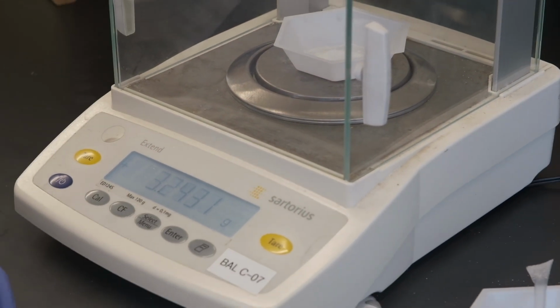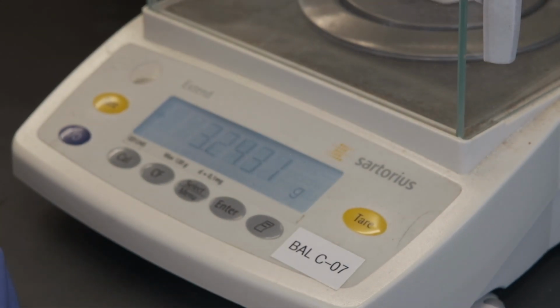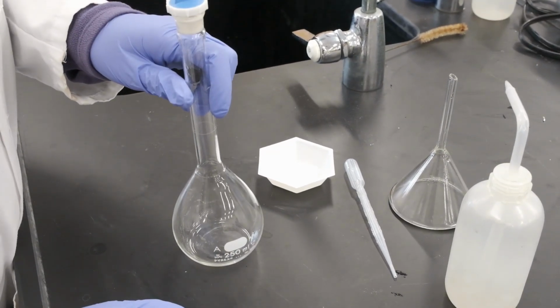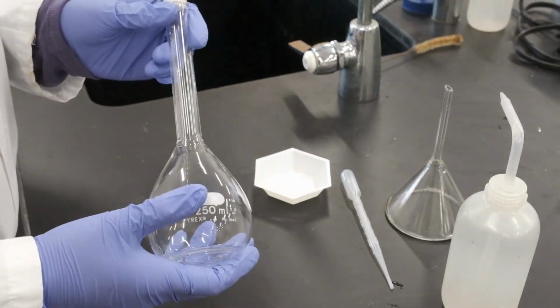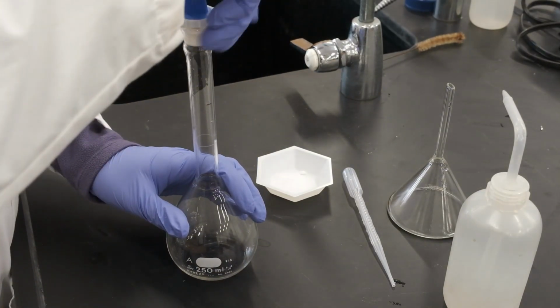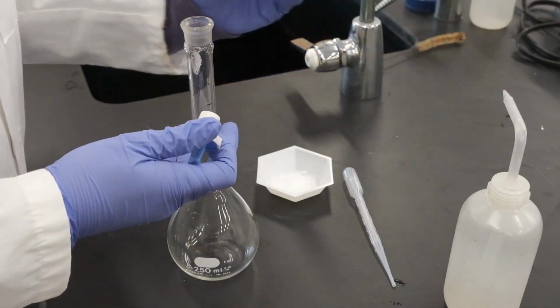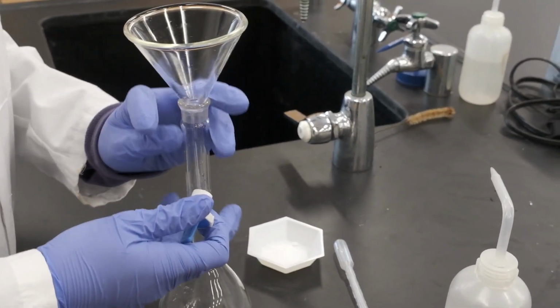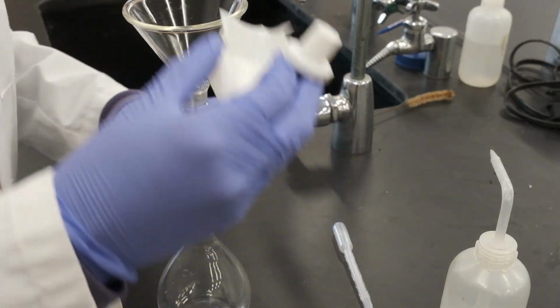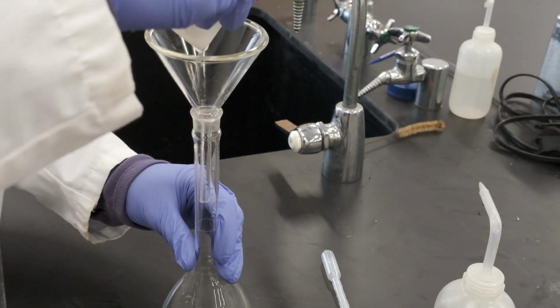Record to the correct number of significant figures the mass of the oxalic acid. We're going to be making the oxalic acid solution. So using this clean volumetric flask, we're going to place our funnel and add it.